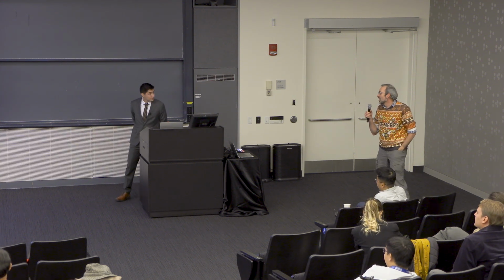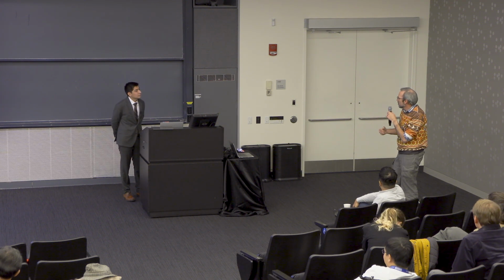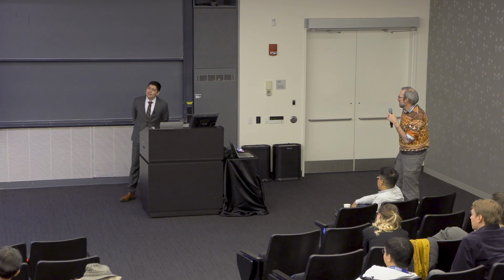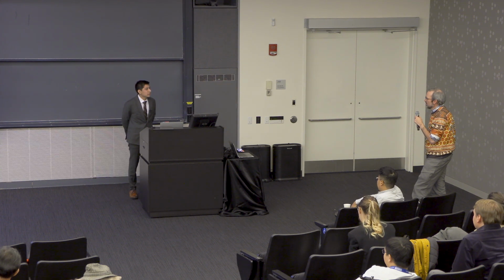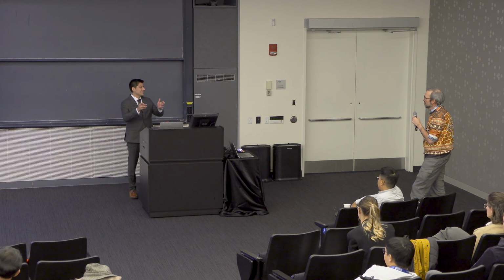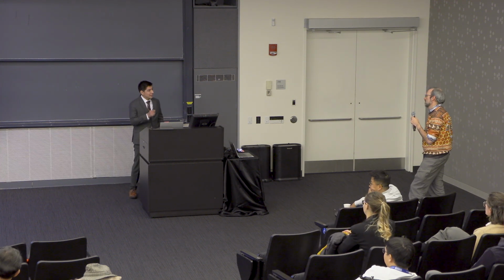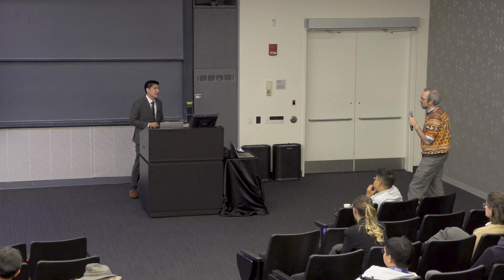I have a question. The ripple features that you observe, these are in folded sheets. Have you ever seen two of them actually merge and annihilate the way it was suggested? Not quite. We're really limited by our electron dose modulation. The thing that we're using to image it is actively changing the properties of the material. I suspect with much more precise dose control, we can definitely see features like that. But for the time being, we haven't been able to.